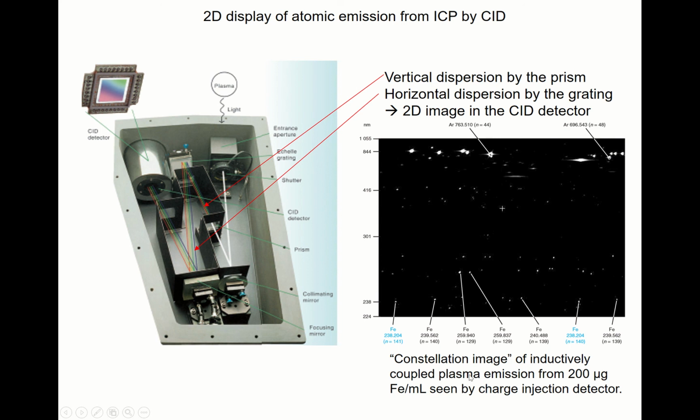Inductively coupled plasma emission from 200 microgram iron seen by charge injection detector. Those bright spots above here are all argon.